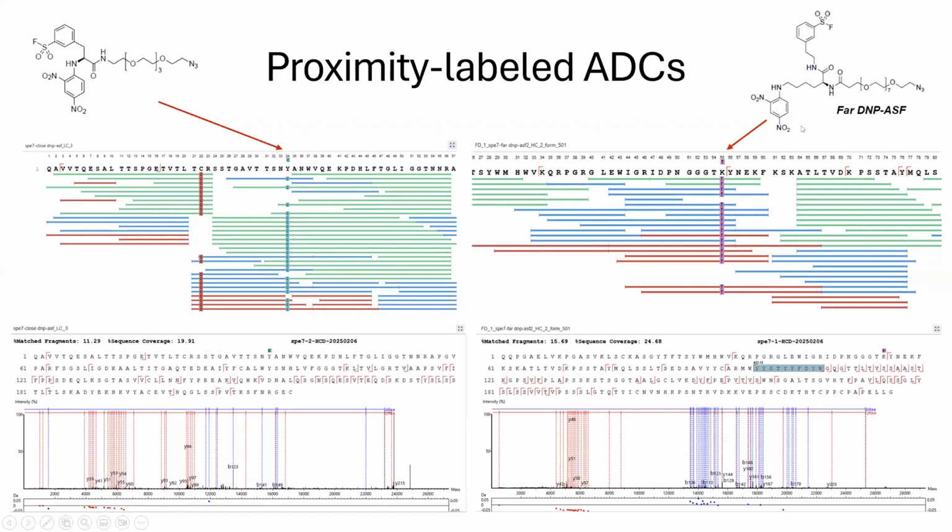And then by using this different type of linker arm, they were able to conjugate a different molecule to lysine 55 of the heavy chain. And so again, we have high confidence in the localization site supported by this bottom-up data. And we can further support that by top-down data, which is shown at the bottom here.